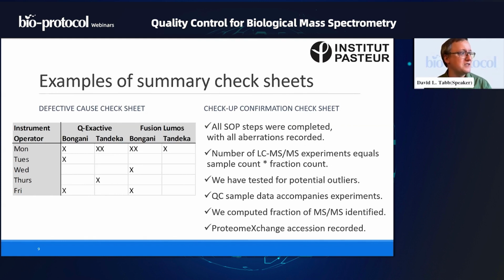You might think, oh my goodness, I don't want any core facility posting my data. It's going to take me a long time to write the paper. But I would note that ProteomeXchange certainly gives you the option of posting files privately that are passworded, that only become public when you say so. So that way you can already have your ProteomeXchange number ready to go when your paper is accepted.